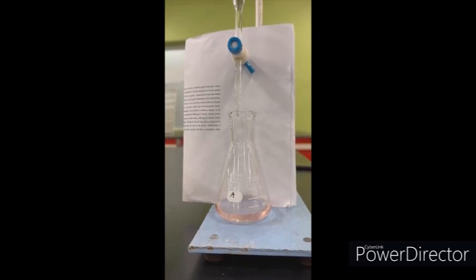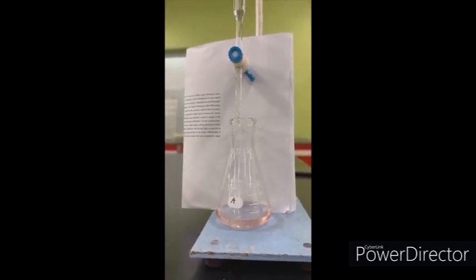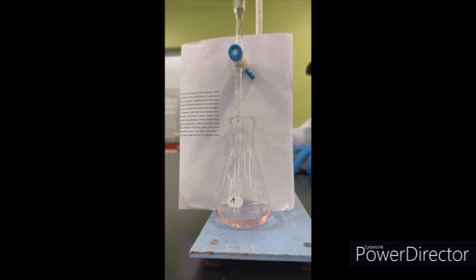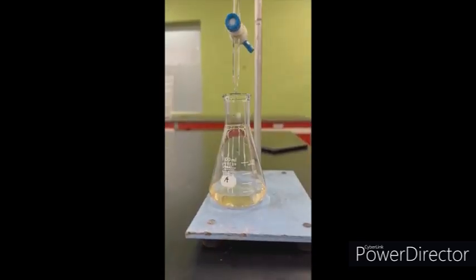The conical flask A was placed under the burette stand to ensure the titration process. You can see that the drop of pure solution was dropped from the burette into the conical flask. At the same time, the white paper was placed to ensure the color change to be shown clearly. After some time, the color of solution started to change.